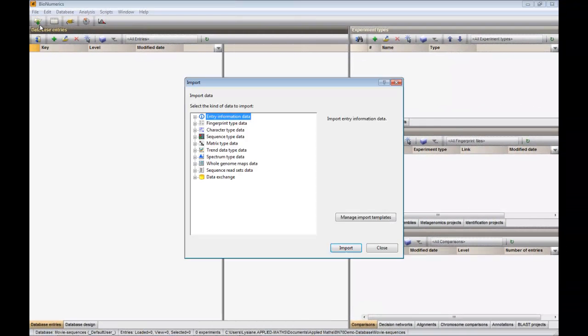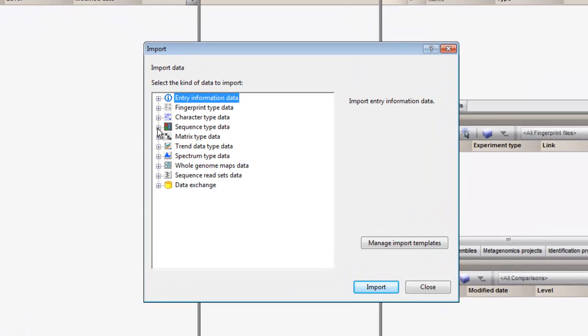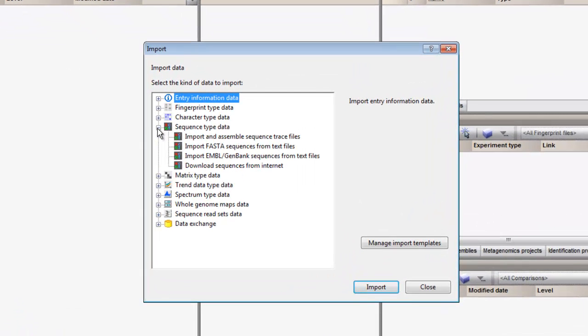When we press the import button in the main window and expand the sequence type data field, the third option allows us to import sequences from text files in EMBL or GenBank format.